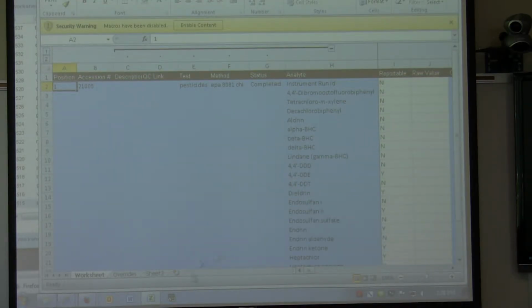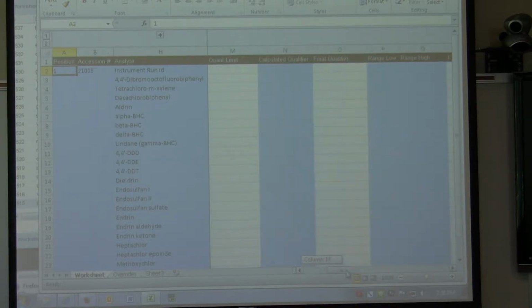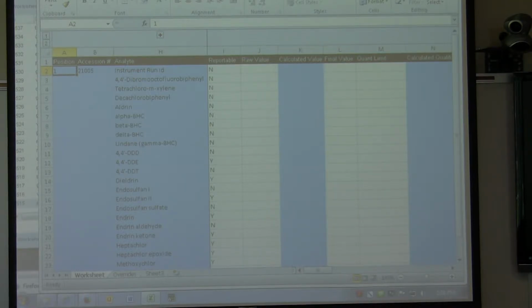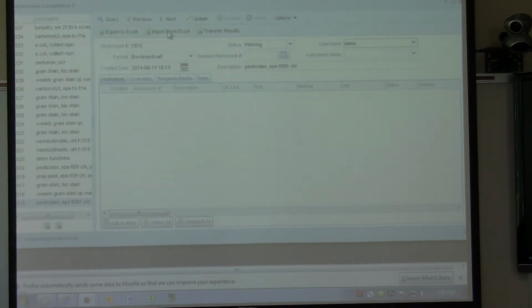So yeah, this one's one of the more complicated ones. You've got all these calculated fields out here. If you were to mess with all that stuff, it would do all its calculations out here, and you just load it back in. But she wants you to actually do that. Can we pick a simpler one, for water lot maybe? Like E. coli, one of the first ones, 533 or something. This one? Yeah, that'd be great.